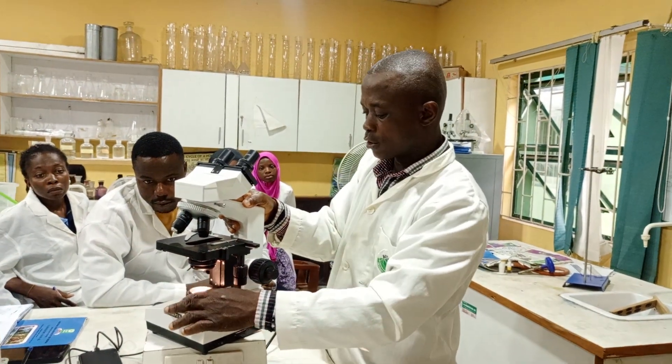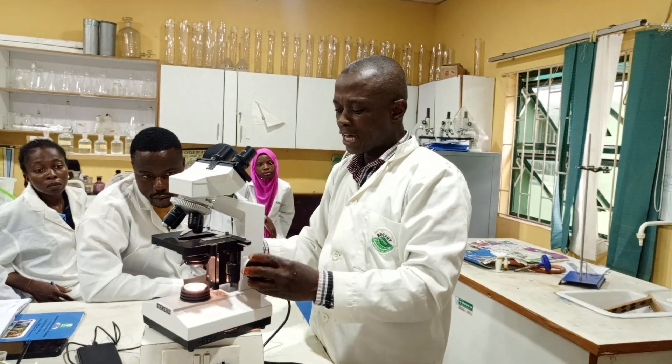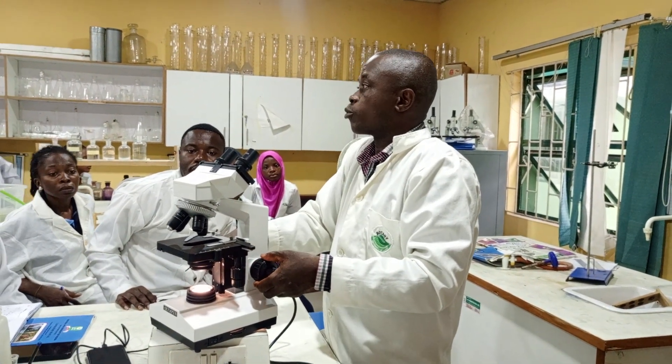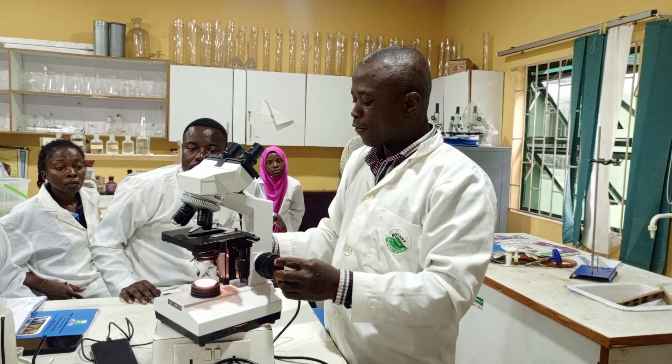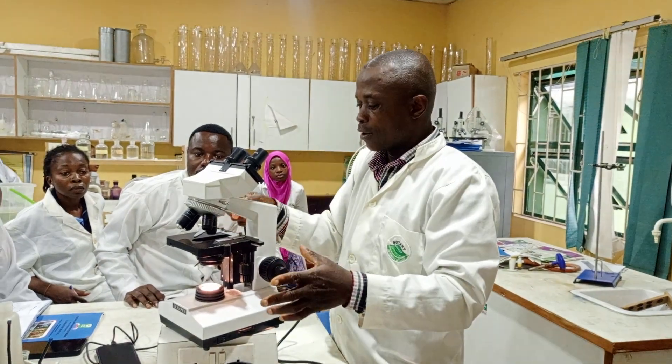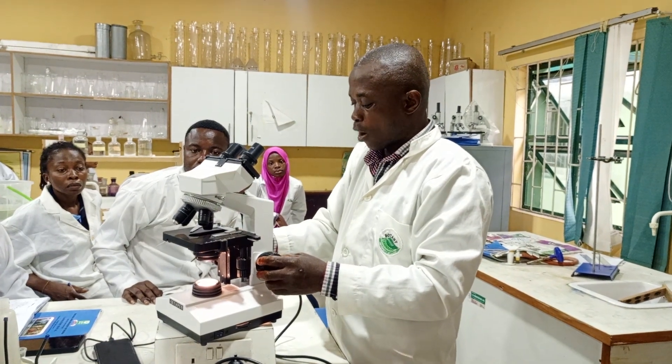We have the light source. We have the coarse adjustment knob, which brings the stage down and also brings the microscope to focus. We have the fine adjustment knob that will help you fine-tune and get the perfect focus after you have used your coarse adjustment knob.